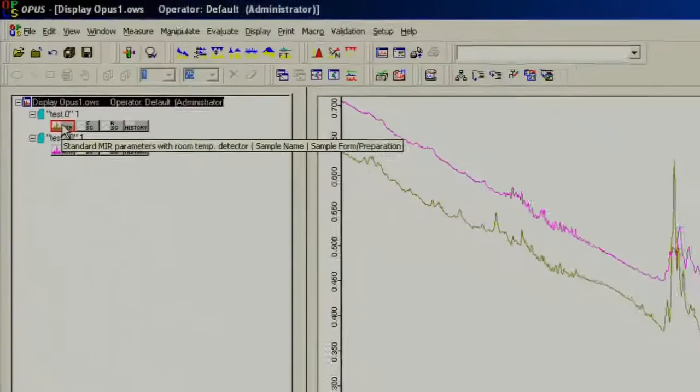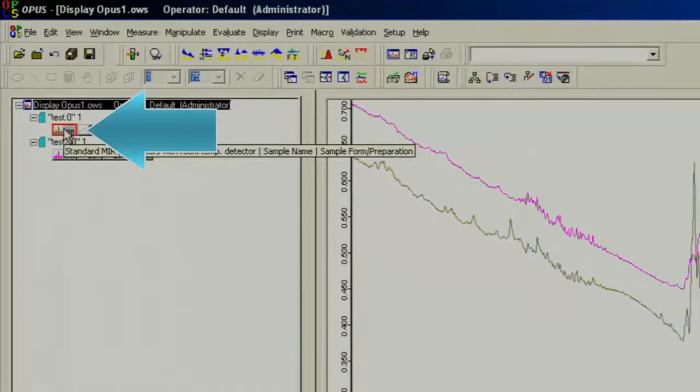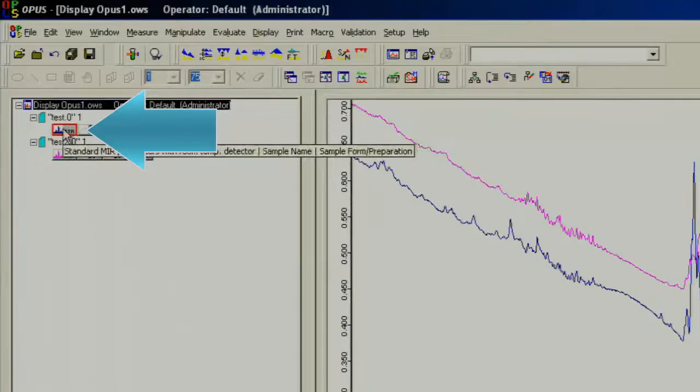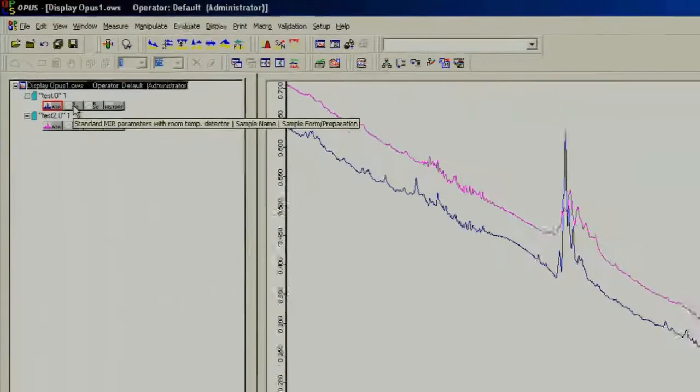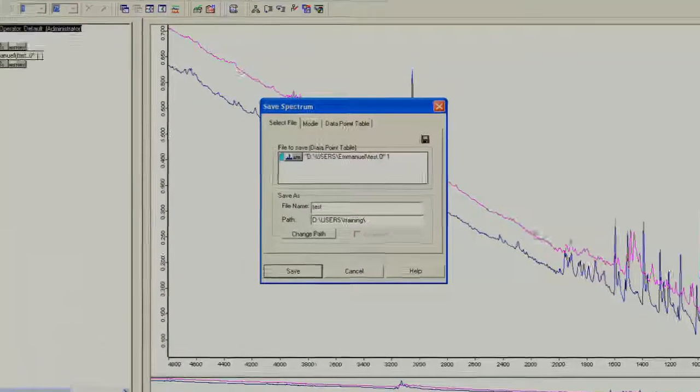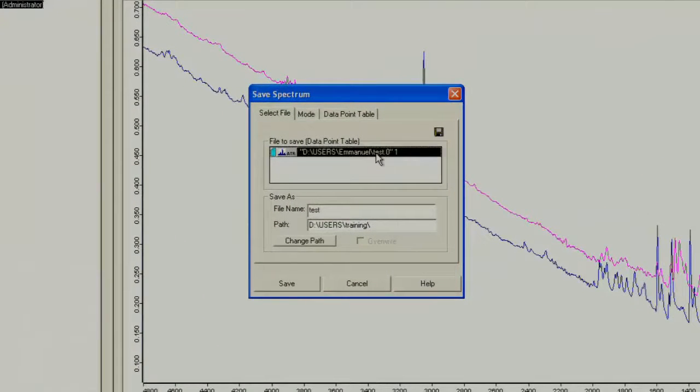This is located in the top left part of the screen, and if it is selected, it will be outlined in red. Once it's selected, click file, and then click save as. Give the file a name. In this example, the name used was test1.csv.